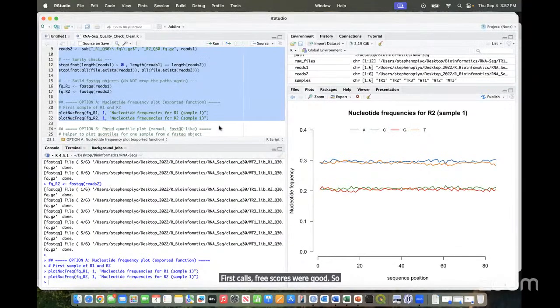So up to this point, what we are doing is just cleaning our reads, quality control. We haven't done anything yet. We're just cleaning. We got our sequences, we checked them, and now we clean them. So what do we do next? We have to align them.